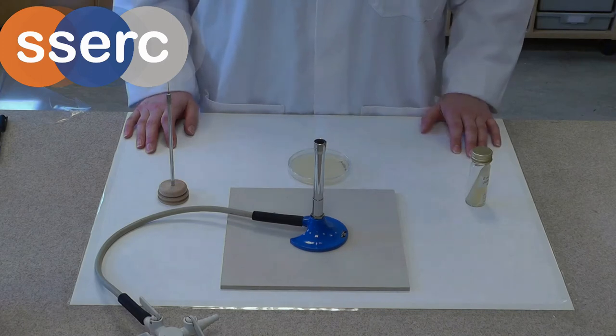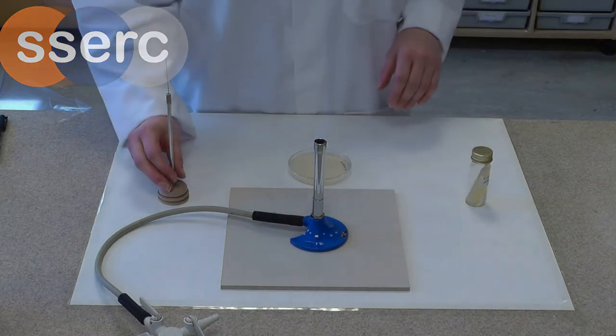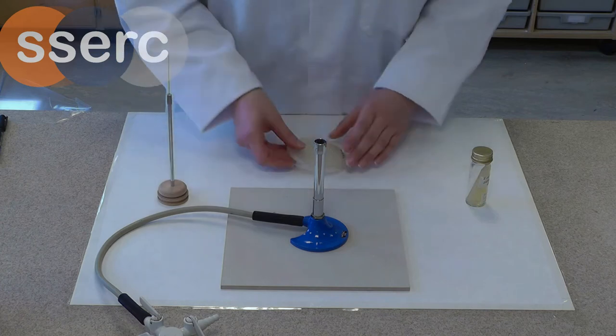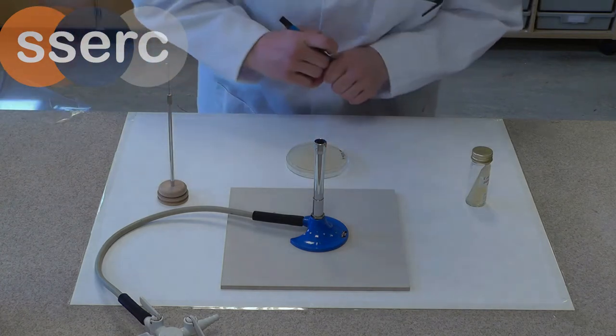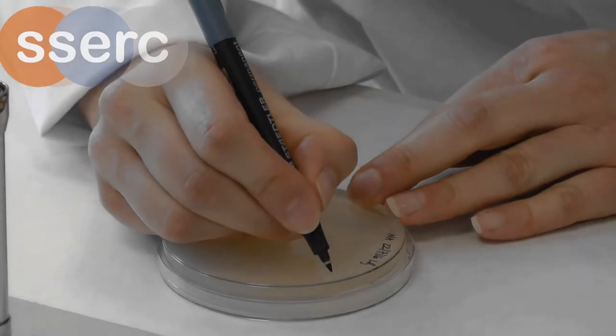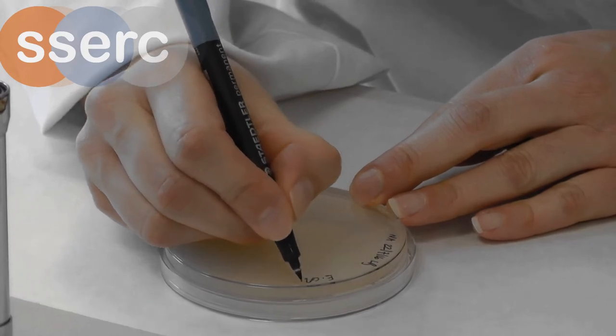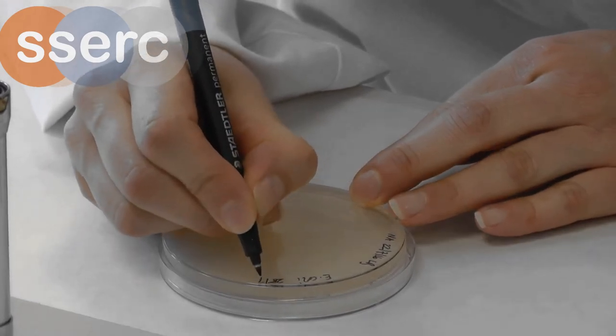Slope to Plate. First thing to do is to label the plate on the underside with your initials, the name of the organism and the date.